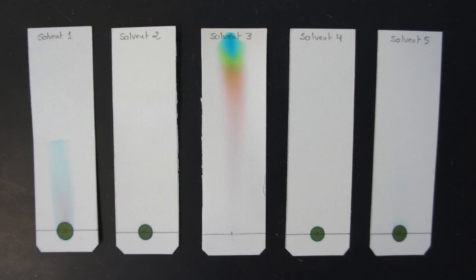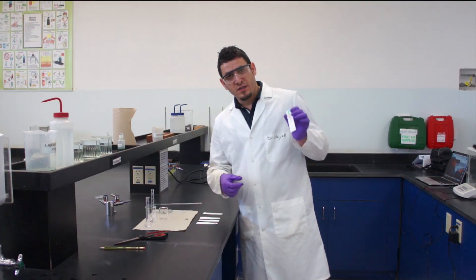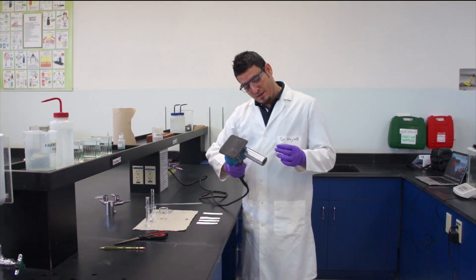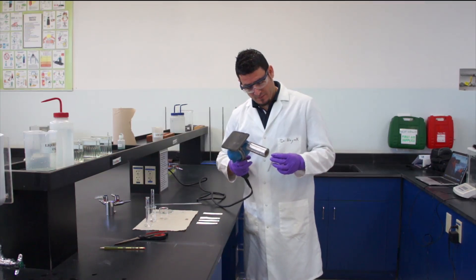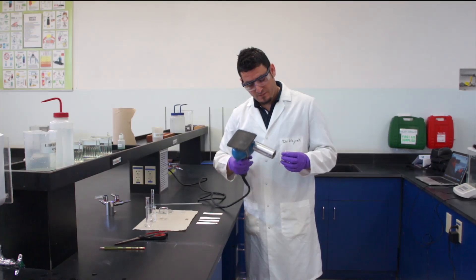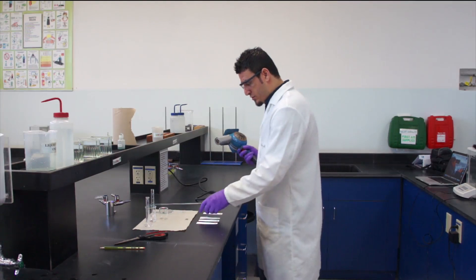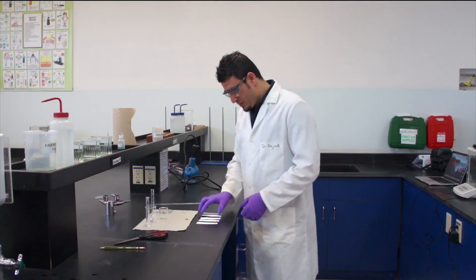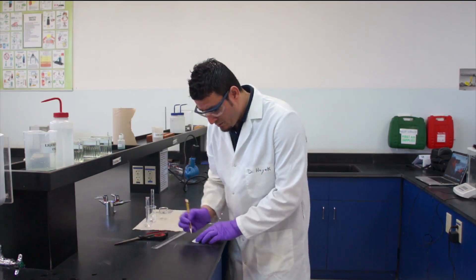After waiting enough time for the mixture to separate on the chromatography paper — and you'll notice there is only one solvent where the separation works perfectly — you need to dry your paper so the solvent does not migrate above the end line. Using a heat gun, dry your paper carefully. Once dried, you can identify where the end line is.